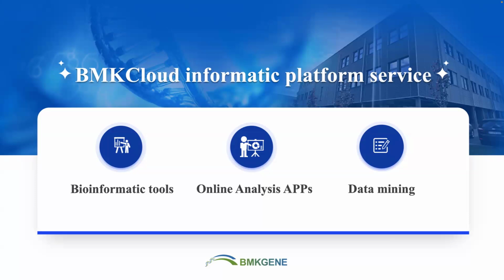First of all, you should know that BMKCloud can offer a one-stop solution. We have bioinformatics tools such as image generator, sequence analysis tools, and data processor. You can use online analysis applications to do some basic data analysis. BMKCloud provides various analysis applications. After you get your final report, you can do data mining or customize images without an application. You can change colors, reset groups, or other customized settings by yourself.